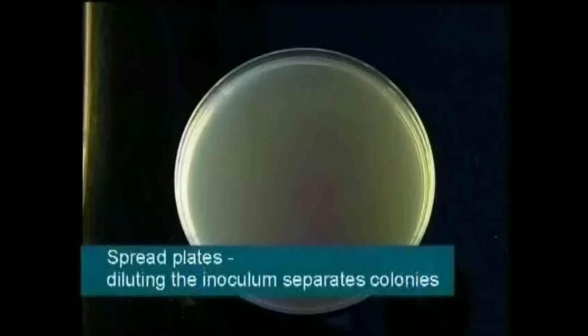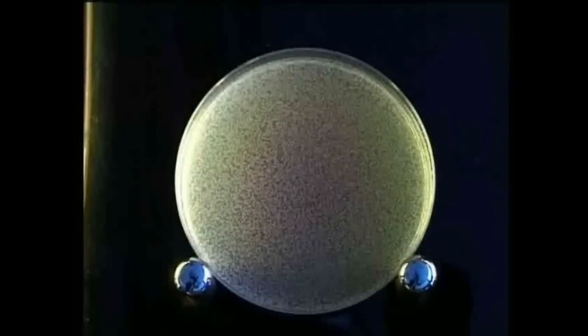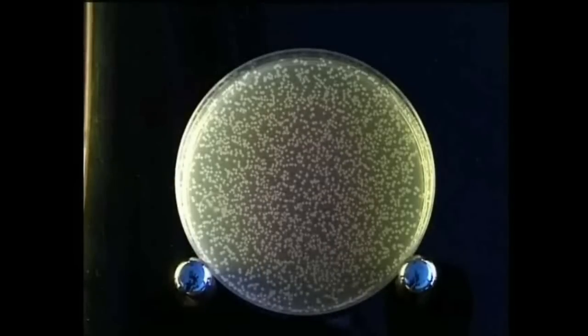A sheet of bacterial growth over the entire surface of the medium is called a lawn, or confluent growth.